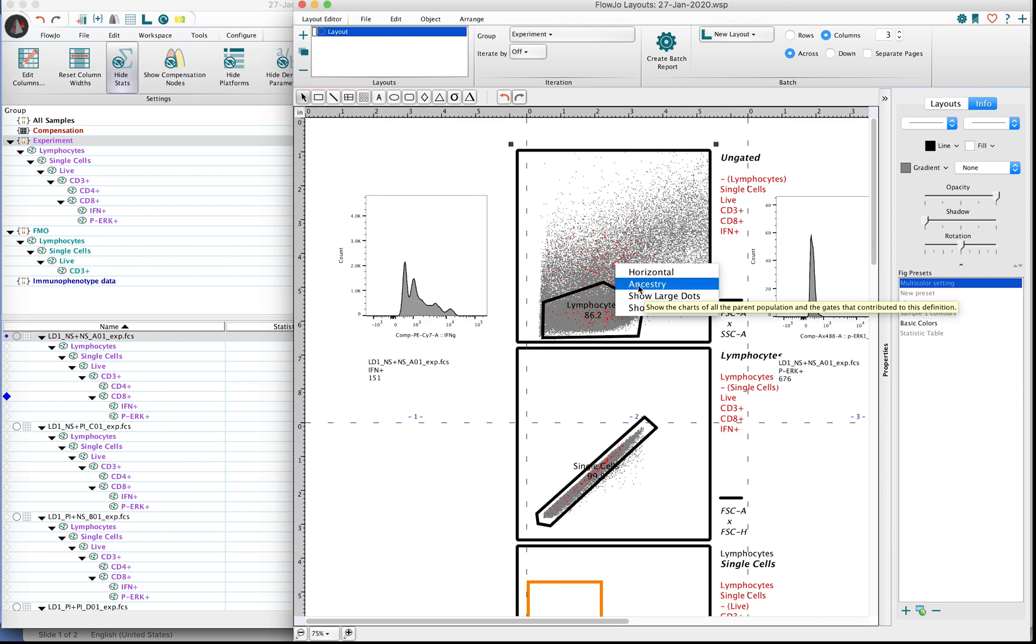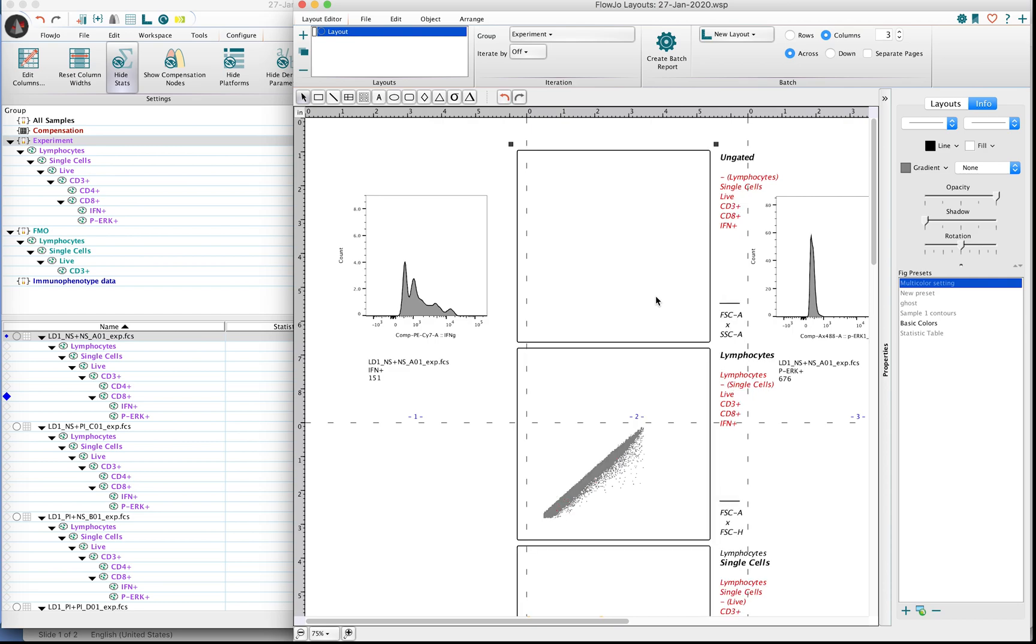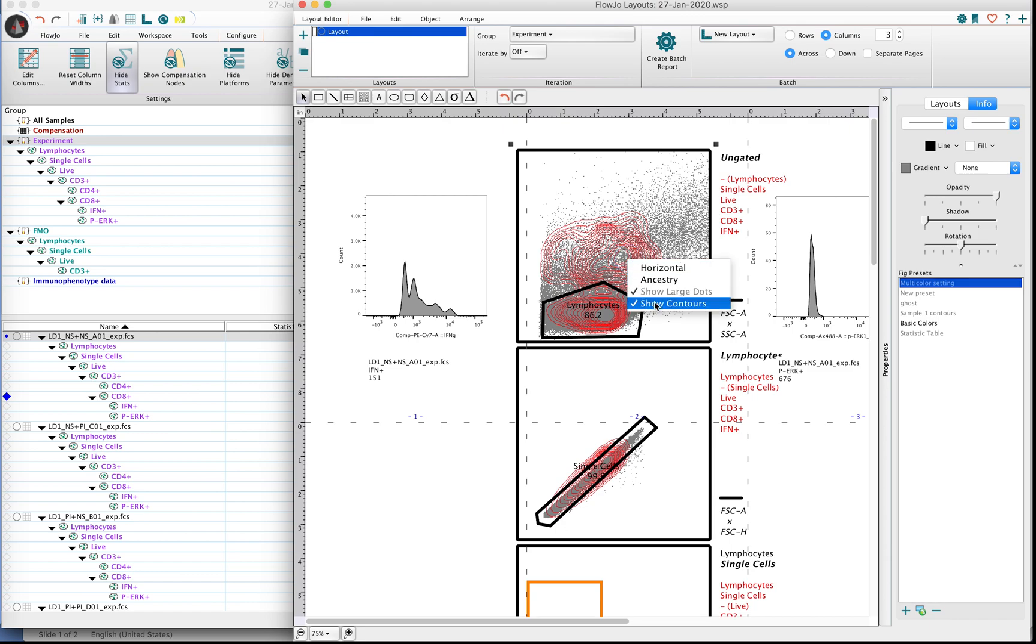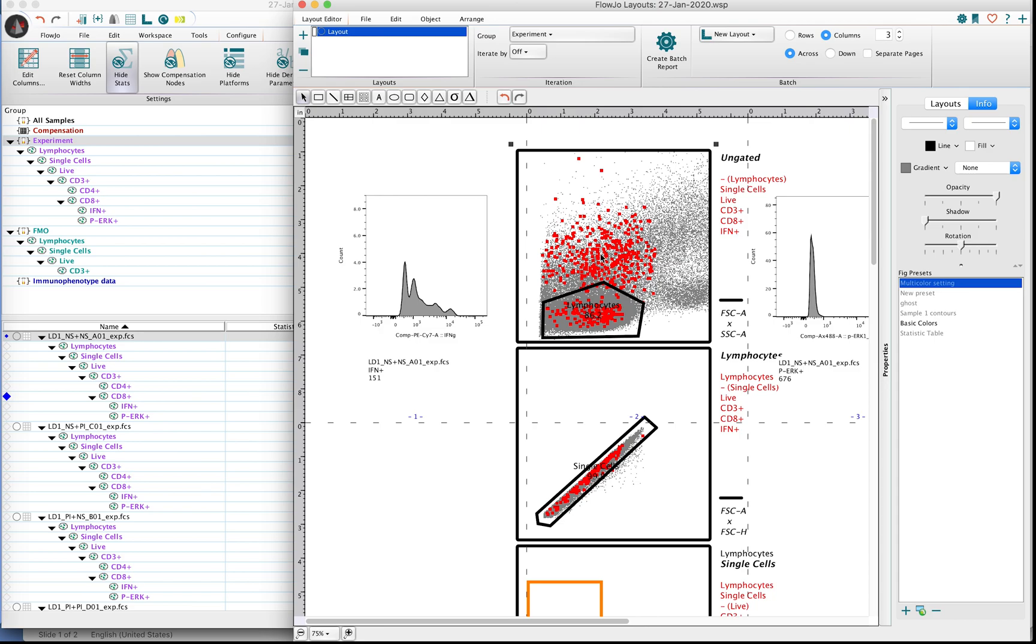You can switch between Ancestry and backgating if you'd like to. You can also show large dots, which is probably one of my favorite options. And then you can also show contours, where you make contour lines for the actual backgated events versus all other events. So if I untick this, we'll kind of go back to my favorite way of viewing this, which is the large dots.